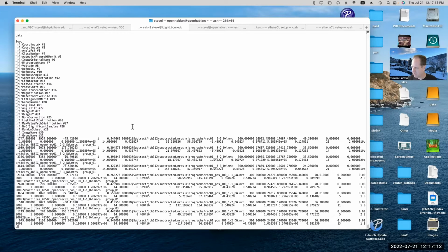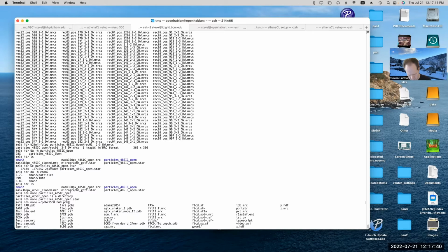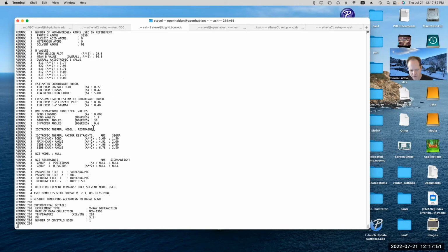So just a little bit of history on metadata in cryo-EM. If you look back at the early days of the Protein Data Bank, they used PDB format files, which we can just look at one, and it looks something like this. They're human readable text files. Each entry exists on one line in the file.